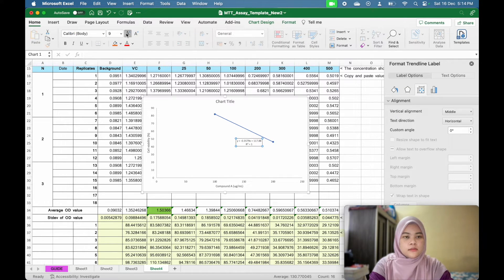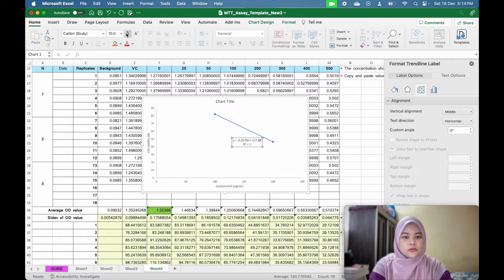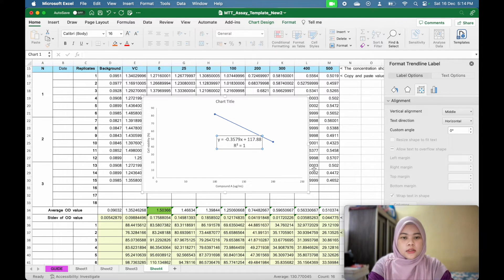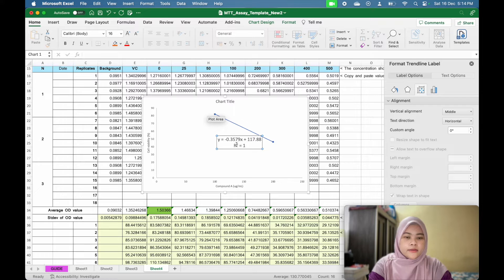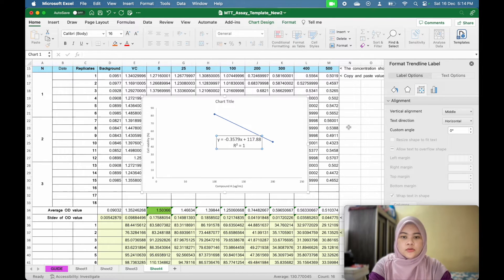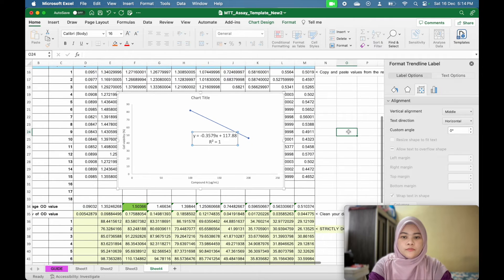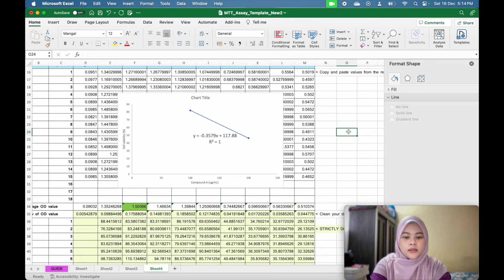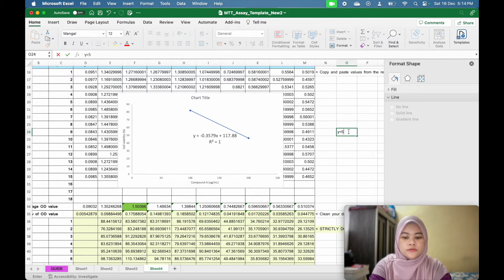Now you get this Y equal to MX plus C. Let's make it bigger, the font. Now at Y equal to 50, what is the value of X? So Y equal to 50.